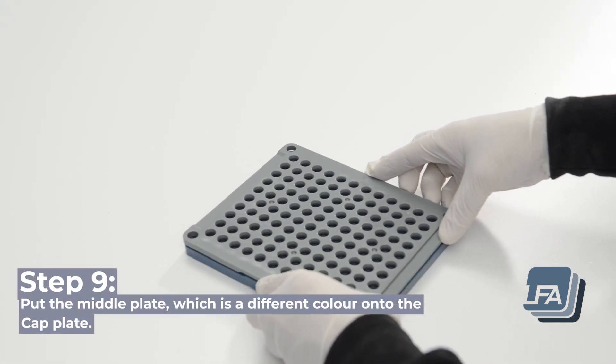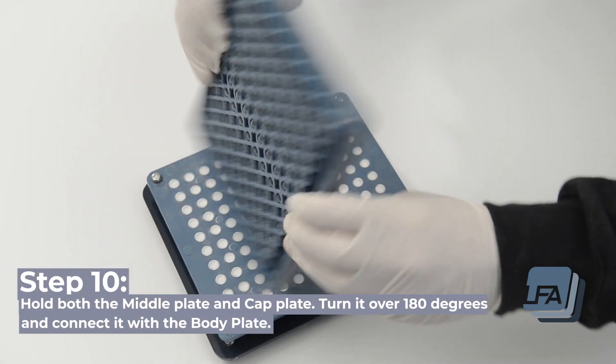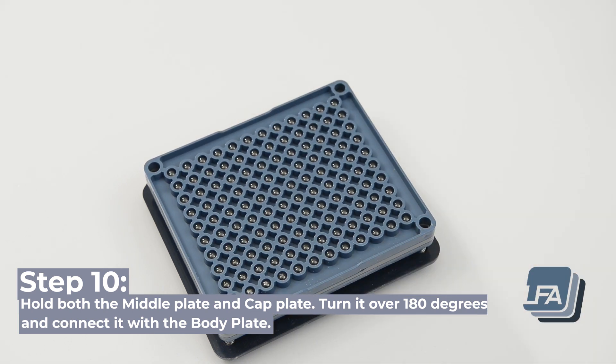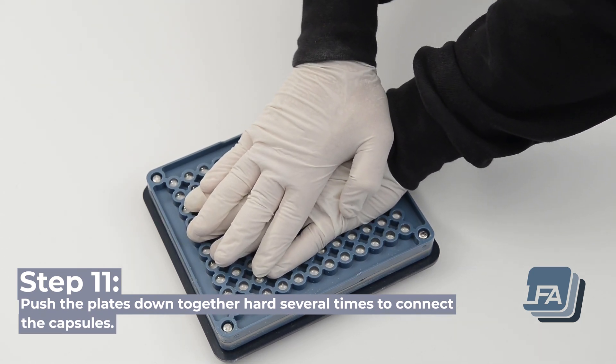Step 9: put the middle plate, which is a different colour, onto the cap plate. Step 10: hold both the middle plate and cap plate, turn it over by 180 degrees, and connect it with the body plate. Step 11: push the plates down together hard several times to connect the capsules.